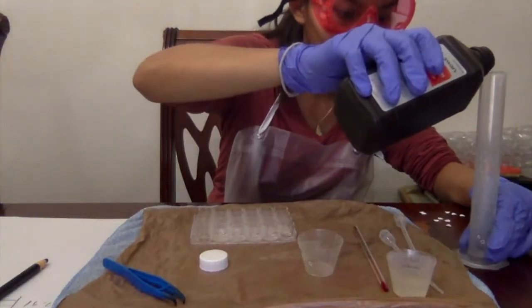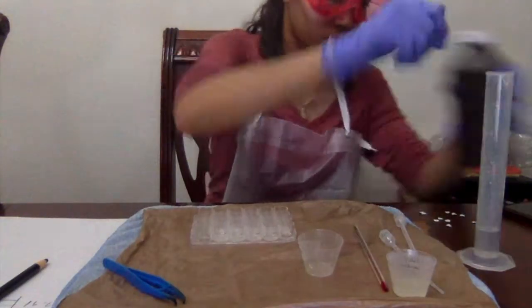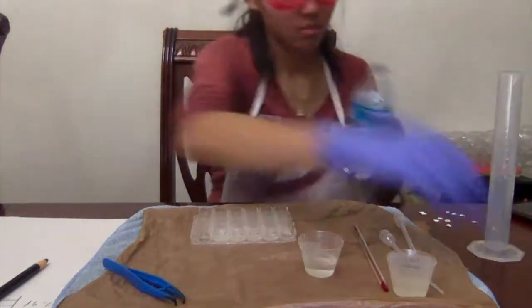In Activity 3 of the Enzyme Catalysis Lab, the impact of pH on the decomposition rate of hydrogen peroxide by the enzyme catalase was being tested and examined. First tested was the pH of hydrochloric acid. Ranges included 1.3 pH, 2.3 pH, 3.3 pH, 4.3 pH, and 5.3 pH.